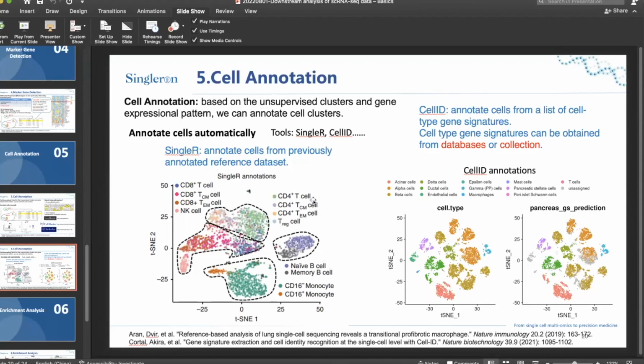Those cells are treated and captured with different technologies and from different labs, so they can be very different, and the overlaps of the expressed genes can be very different from each other. When you are integrating these datasets together for use with your own data, the batch effect should be considered. I think later in webinar 5, we'll have more details about how we could integrate data and deal with these types of questions.